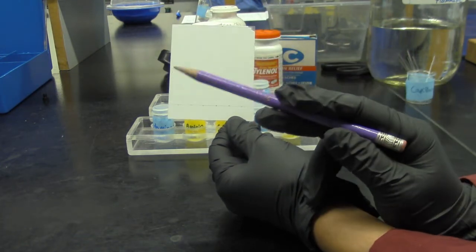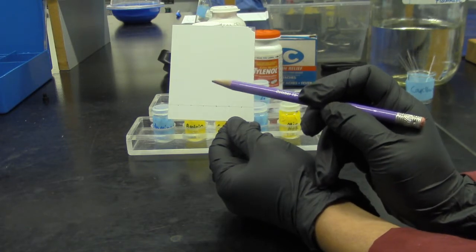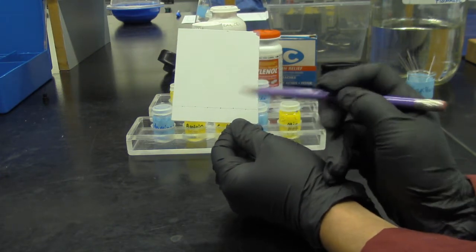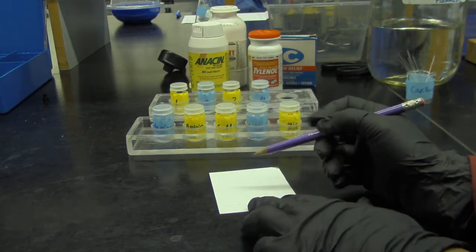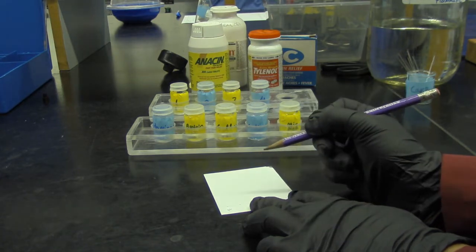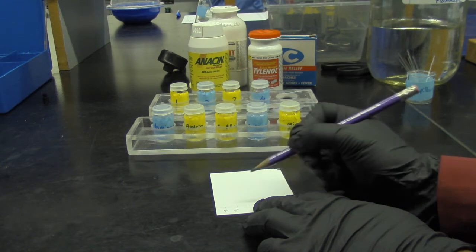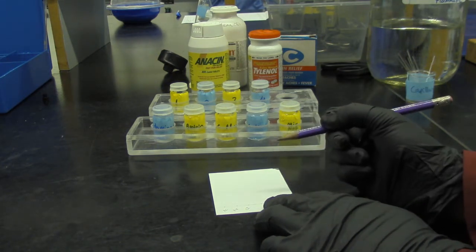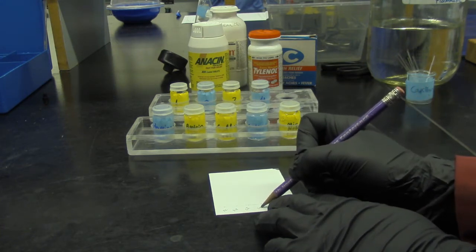Next I'm going to label them first using a pencil. Make sure you lightly label the TLC plate with a pencil. I'm going to label them before I spot the sample. The first spot is going to be acetaminophen, so I just write AC. The second is aspirin, so ASP. The third one is caffeine, so I put CF. The fourth one is salicylamide, so SAL.